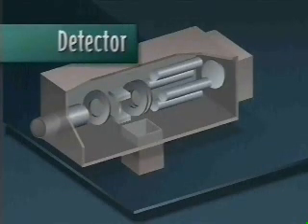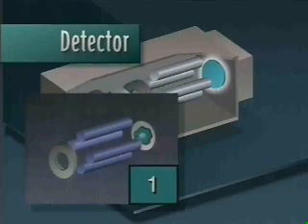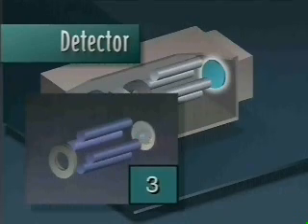A detector is used to collect and count ions or detect their resulting current. Only one mass-to-charge ion is detected at a given time. When the mass-selected ion collides with the detector, the resulting signal can be displayed by the data system.